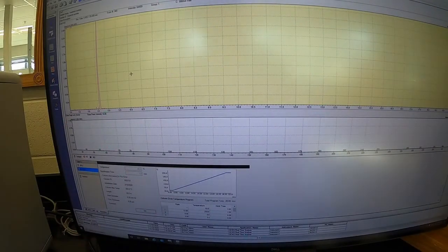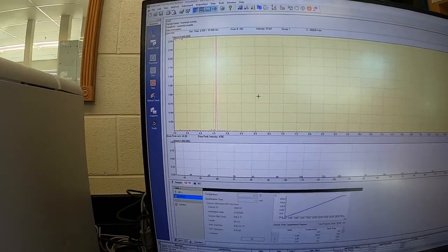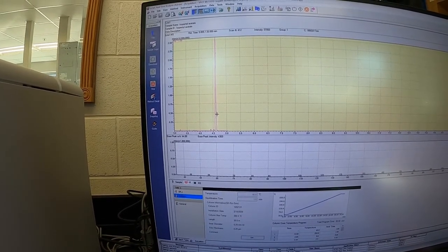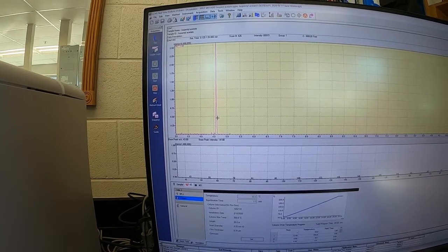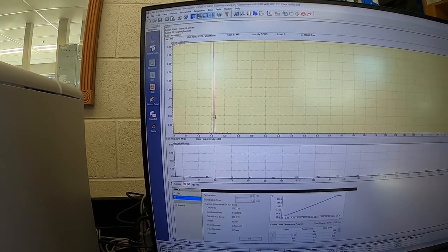Okay, the sample's still running, and I know the screen here might be hard to see all of it recording, but hopefully what you can see there is one really big peak. So what's happening again in the gas chromatograph is the sample is passing through the column, and based on differing boiling points, different compounds pass through at different rates.